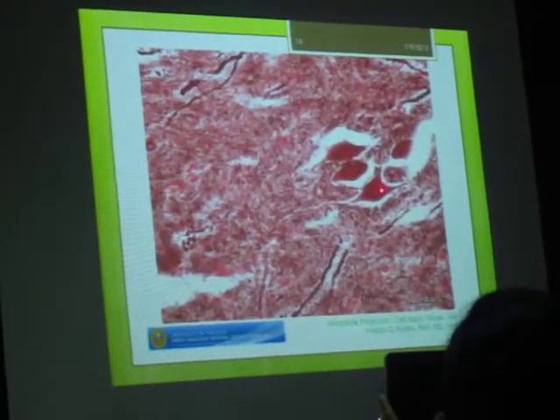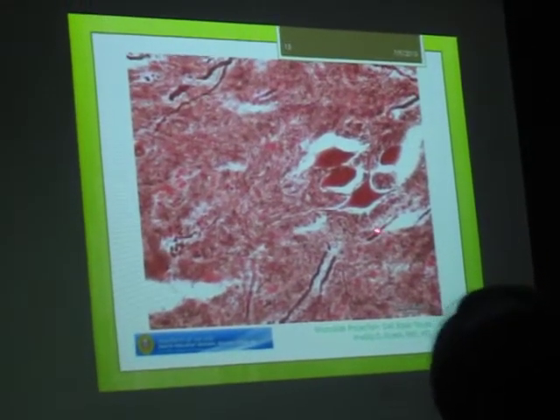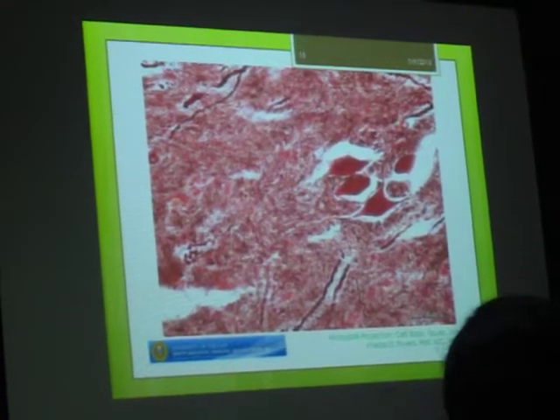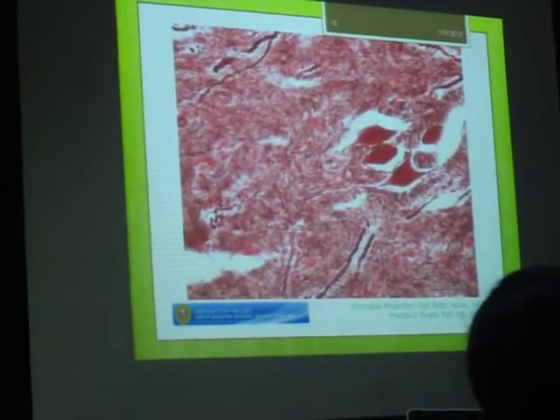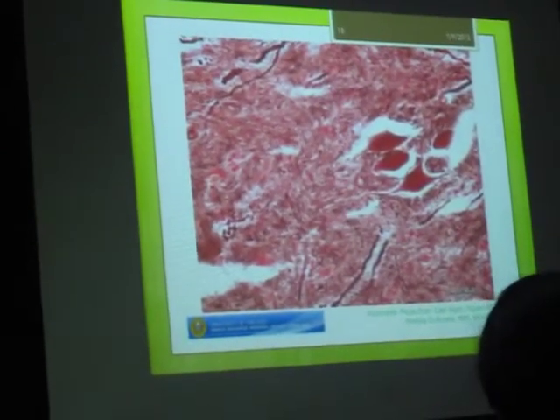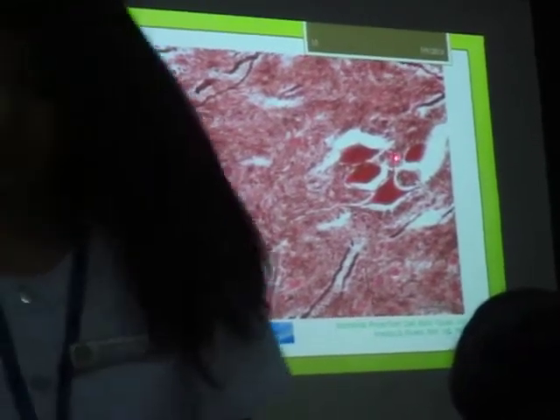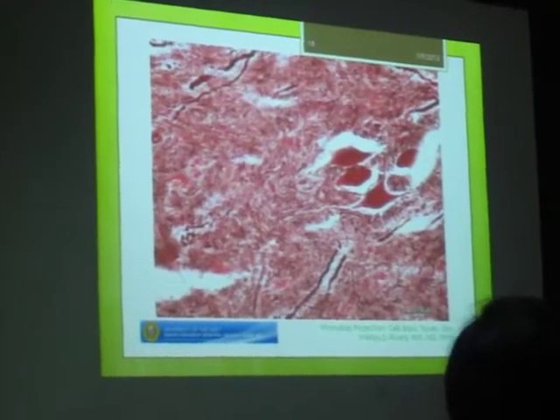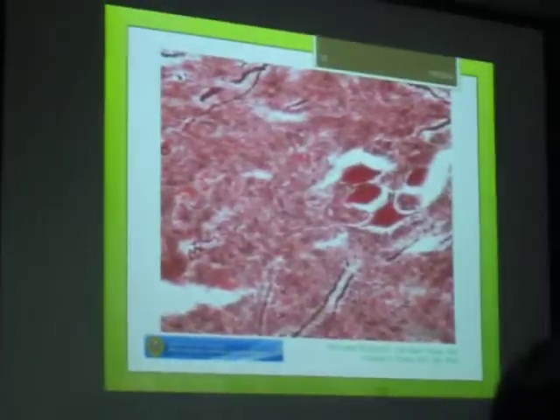Okay, can you appreciate the nucleus? Maybe it's hard here. Okay, sa laptop, it's clear. Okay, so you can also use the neuron to point those two parts of the cell, the cytoplasm and the nucleus. Okay, we can also point the process, this one, the axon, and identify the pointed structure. You will answer what? Axon.